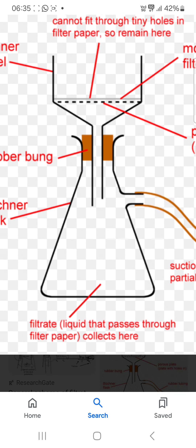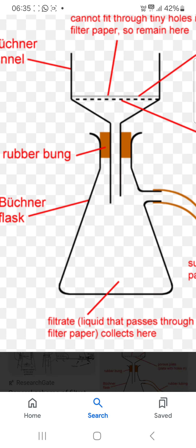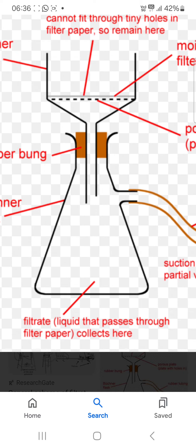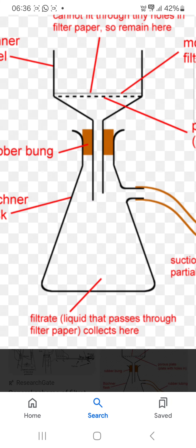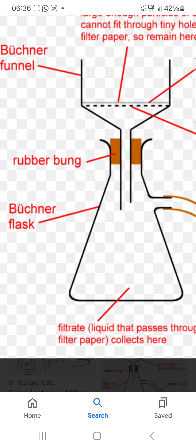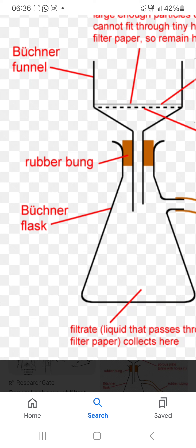The filtered liquid passes through the filter paper — that is the filtrate. It is collected here. Thank you.